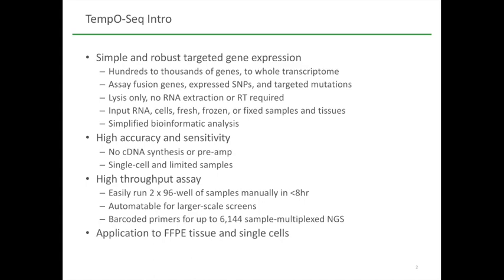At the same time, the assay is amenable to very high throughput processing. Manual processing allows running 96-well plates, anywhere from 2, 3, 4 plates at a time, and these can be conducted well within a working day.